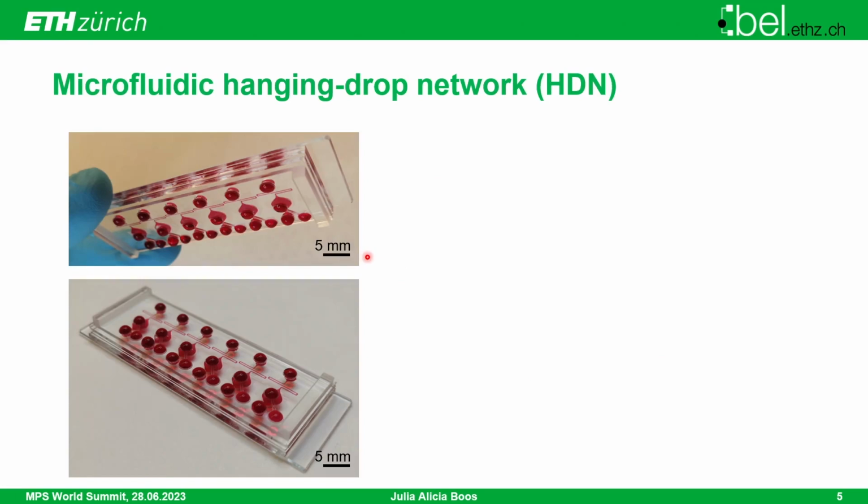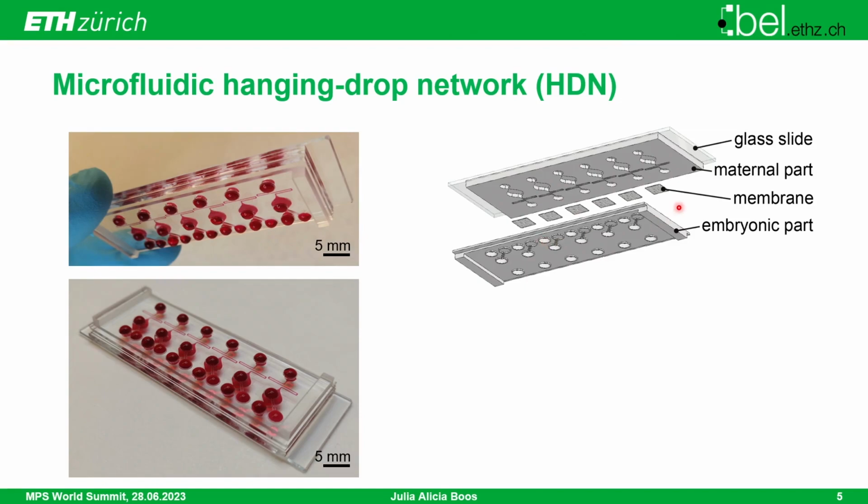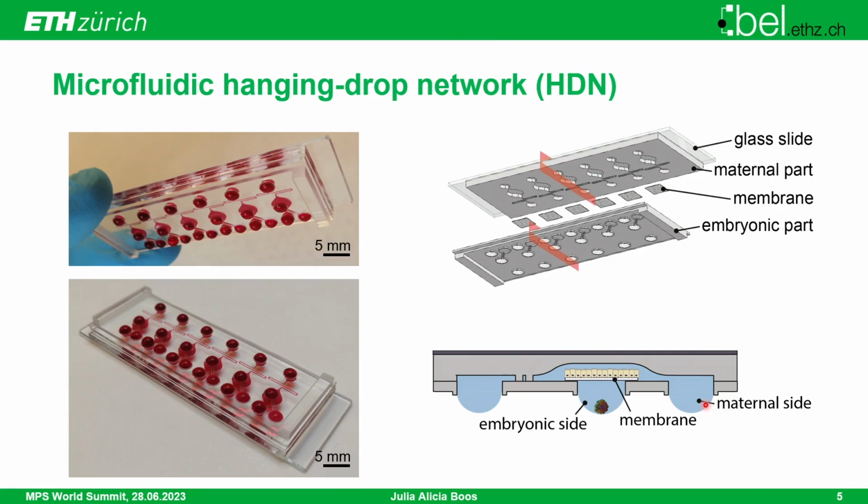Yeah, this is how the platform looks like. It's a hanging drop network. It is designed in a microscopy slide format, and the hanging drops are formed on a PDMS substrate, and they are connected through microchannels and thereby form an open microfluidic network. The chip is composed of two parts, a maternal and an embryonic part, which are separated through this semi-permeable membrane that I mentioned before, that is really distinguishing between the maternal fluidic compartment and the embryonic fluidic compartment, as you can also see here in this cross-section.